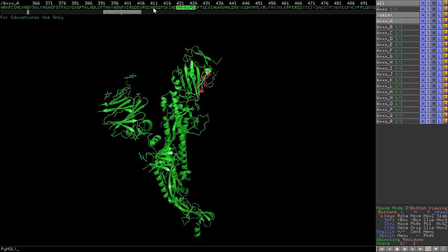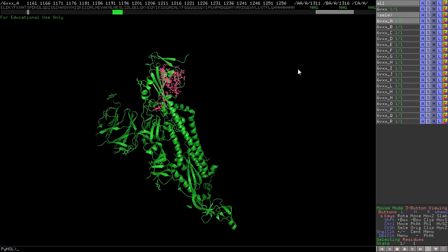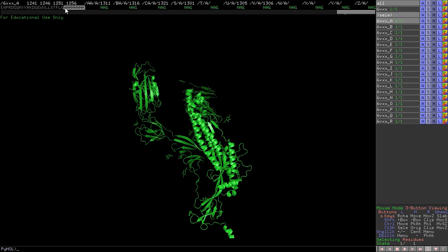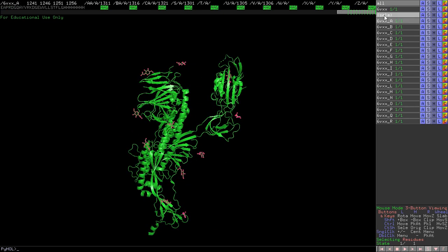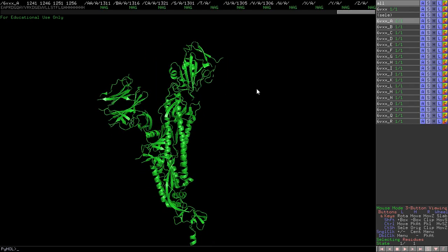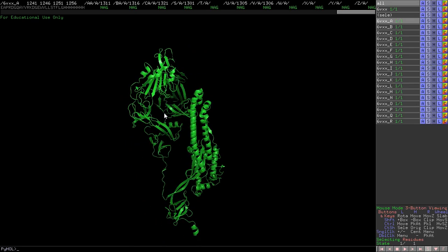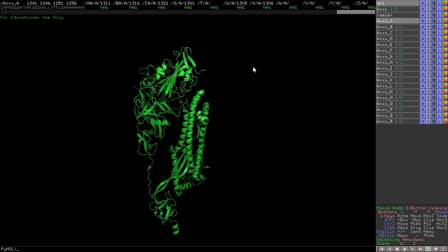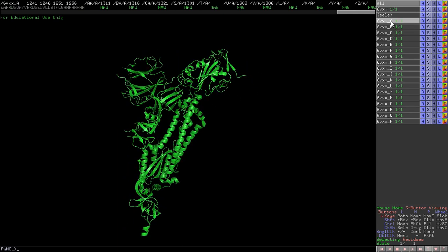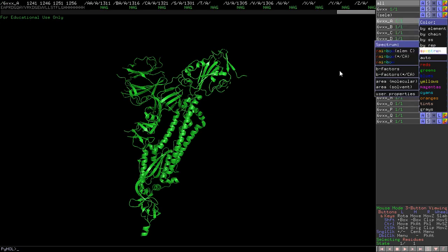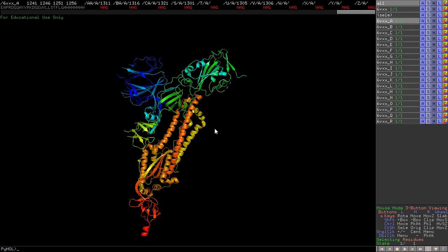When you select a region it will be highlighted. These are histidine residues - a His-tag used for isolation of this protein. Also, NAG - N-acetylglucosamine - these are the glycoprotein moieties. Select them, then 'hide everything', and click anywhere. Now all the carbohydrate moieties are gone. This is the whole spike glycoprotein in a monomeric state. To change the color, go to 'Color', then 'Spectrum', then 'Rainbow'.